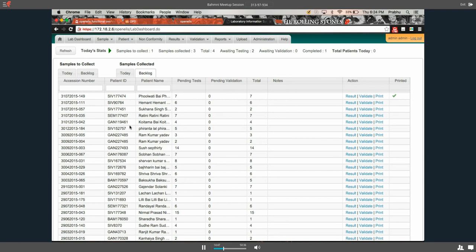I will note this down, Tim. I'm not really sure how to get these things into the product and onto the roadmap, but I'll definitely take a note of these two things and see how we can take this forward. Yeah, we've noted that down, Tim. Right, and so moving ahead.